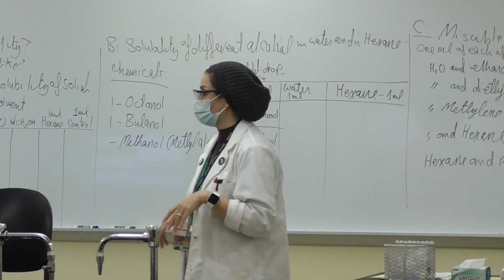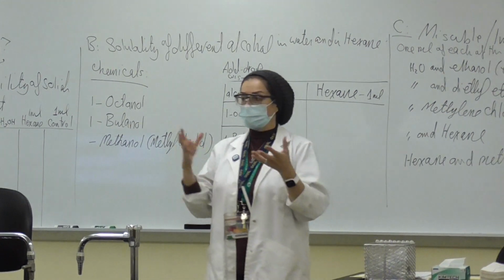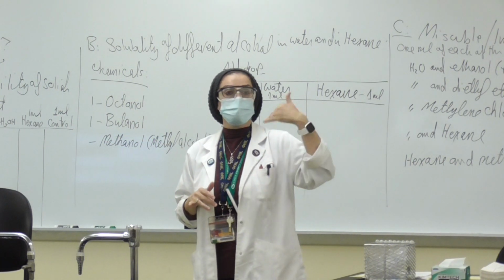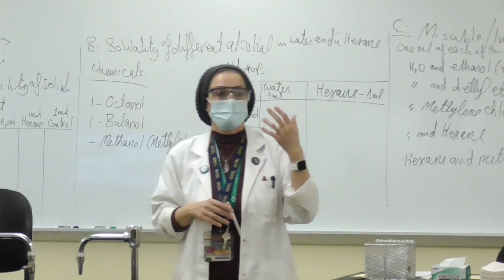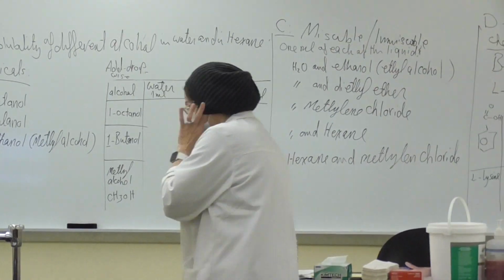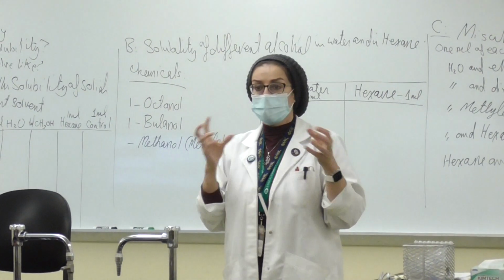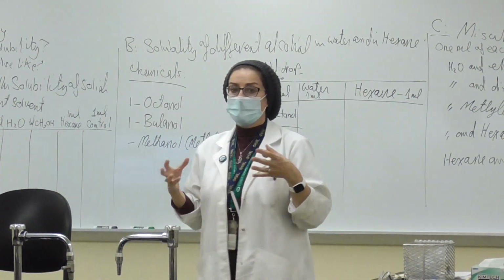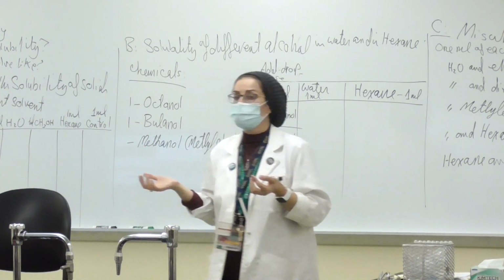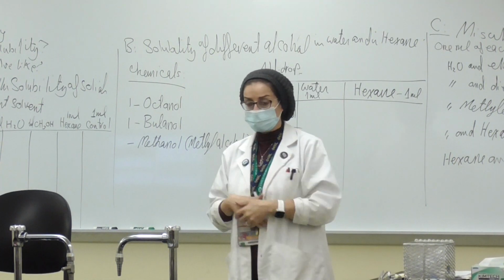Next time we are going to go into extraction, and this is going to be about the combination of any of those solvents, because recrystallization requires a lot of organic solvent, right? So if we do not have an idea, and if we do not familiarize ourselves with the organic solvent and how it works, is it soluble, not soluble, when we're going to mix them together, we're not going to be able to use them in the recrystallization of organic compounds.